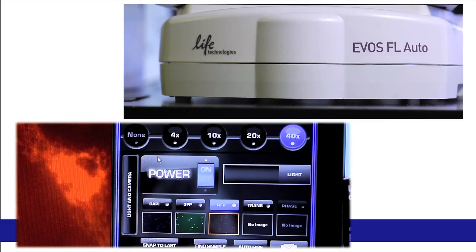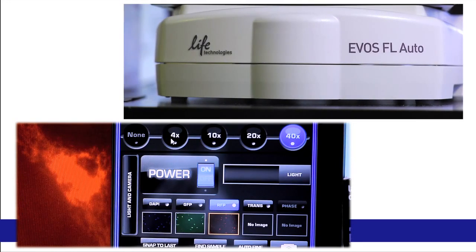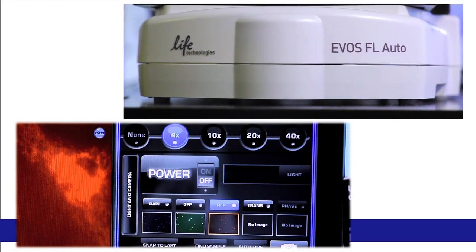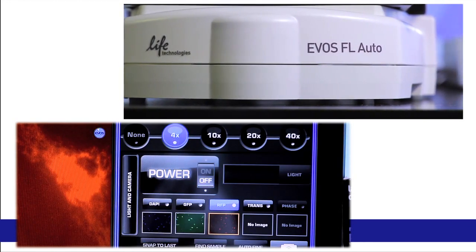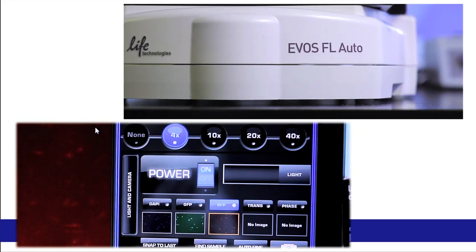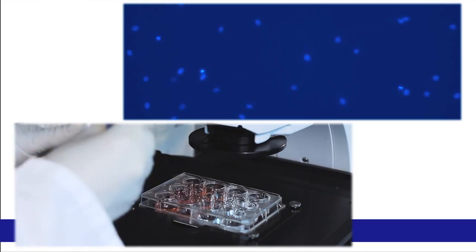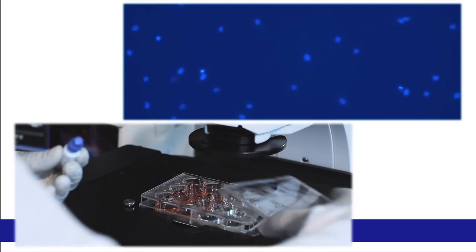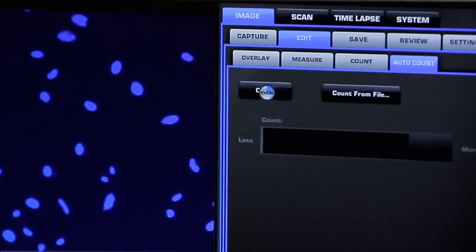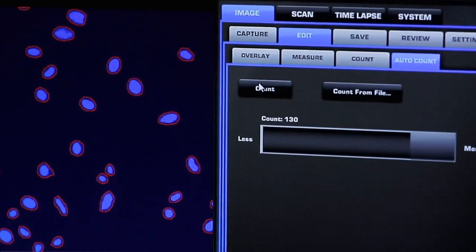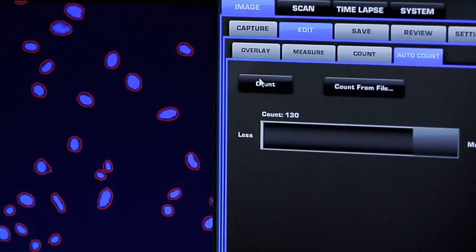The EVOS FL Auto cell imaging system contains advanced software algorithms that allow extremely accurate cell counting from a particular field of view. Following label of nuclei using a fluorescent dye like Nuke Blue Live Stain, the EVOS FL Auto will calculate the number of cells in a field of view even with a 4x objective, making it great for determining the number of cells in a well or dish.